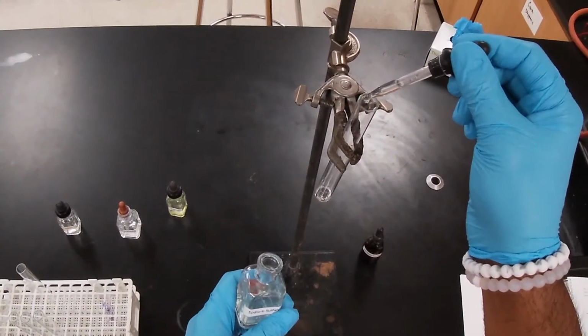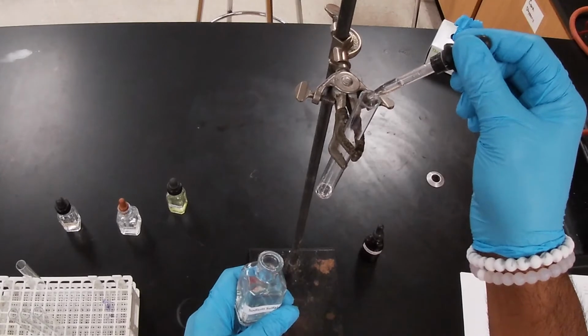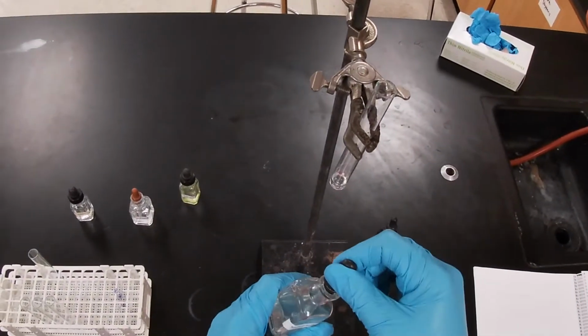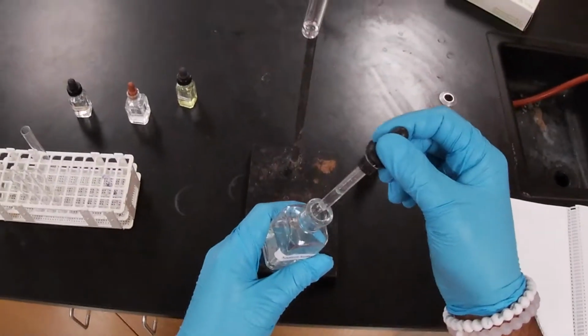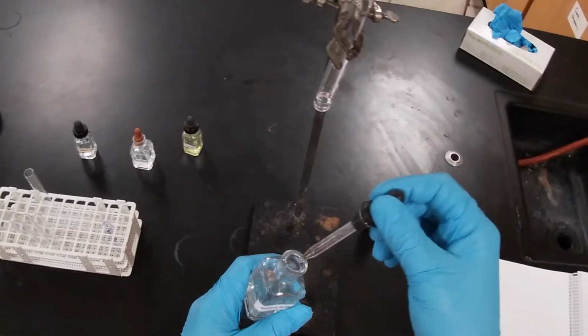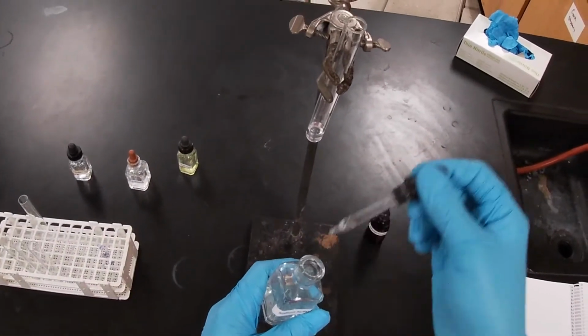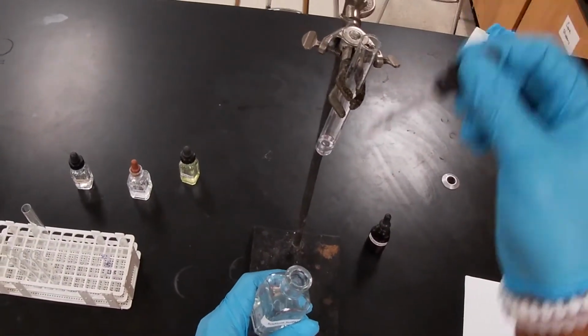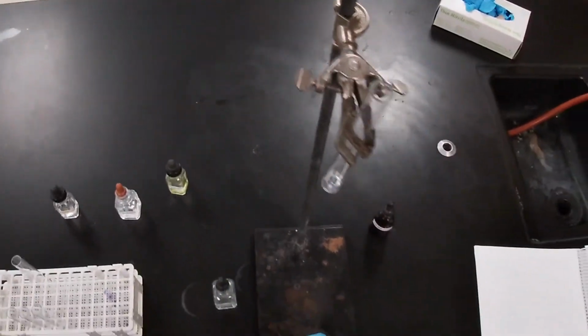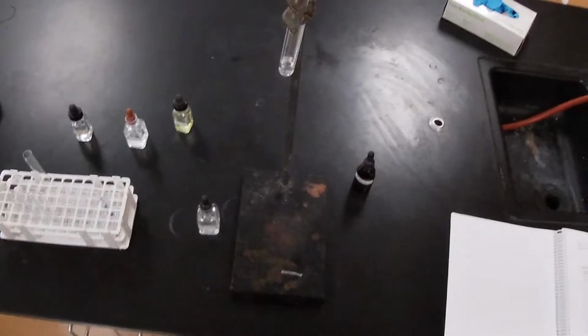As we add one, two, and if you notice, I added the whole dropper full and nothing has happened yet. I'll add some more, just in case. A little bit more, nothing.